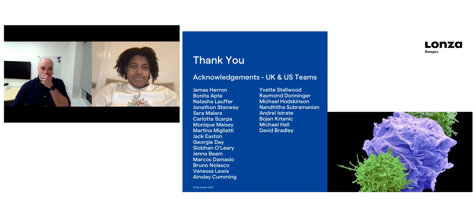Thank you so much for your presentation, Dr. Simon. Now we're ready to move on to the questions. The first one is, do you offer these in silico prediction analyses as a service for peptide therapeutics, their impurities, and for generics? So yes, we do offer the in silico tool as a service as well.